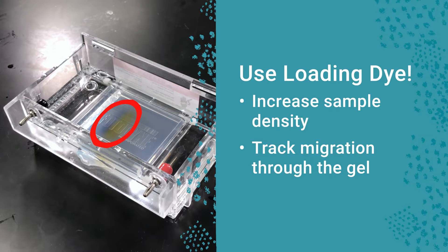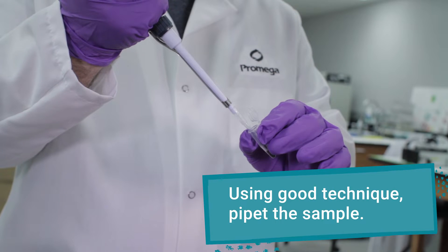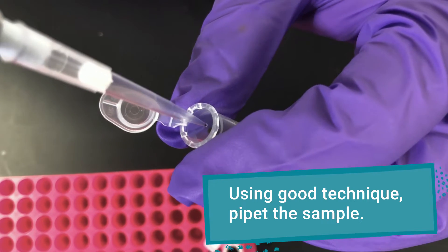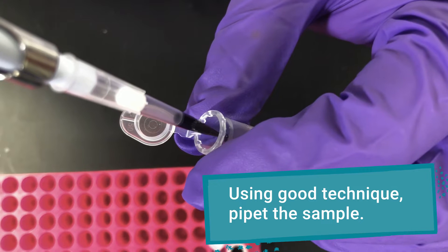To load the gel, use good pipetting technique to draw your sample into the pipette tip. Wipe off excess liquid found on the outside of the tip by dragging it across the top of the tube.